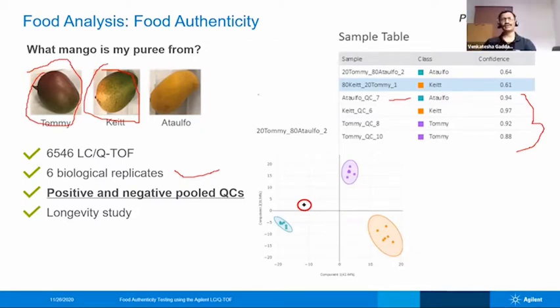Usually I don't do this, but there is something called calibration. Calibration here means you don't have to build a calibration curve. Don't mistake me. There are two masses we always inject to make sure that all the ions are intact. That you may have to do once in a week. If you look at our mango analysis, we did 1 week of analysis without any calibration.